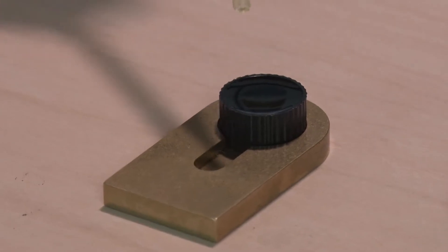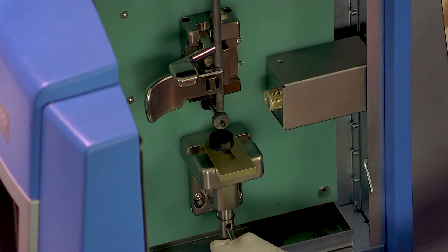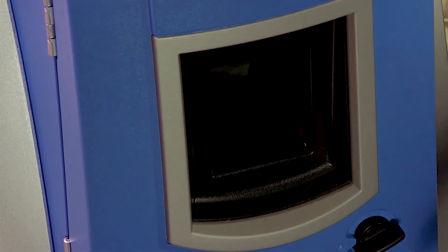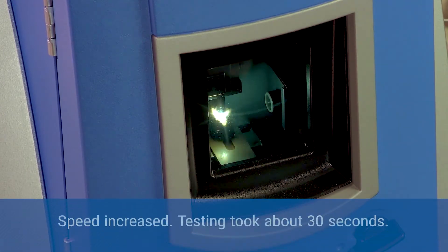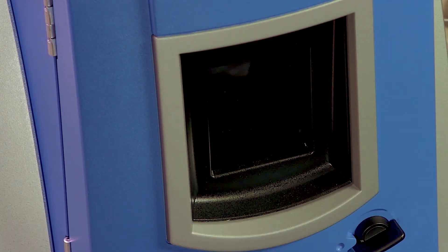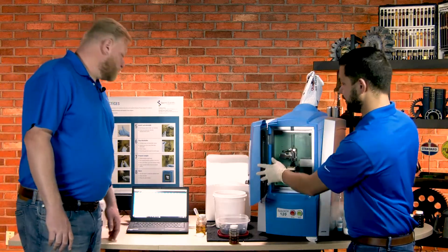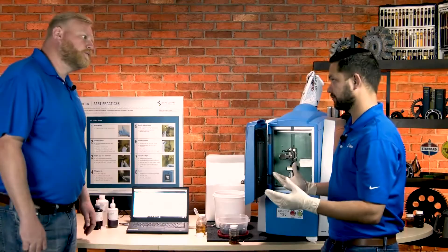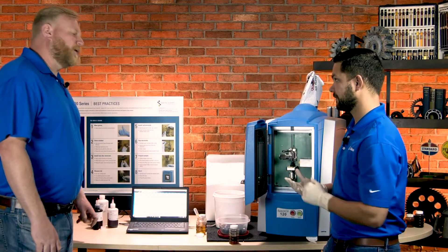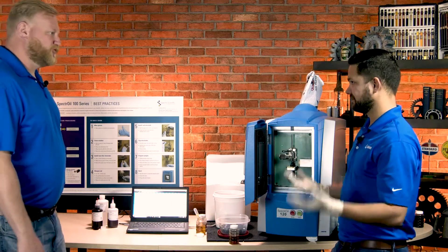Let's run a sample. I've got an oil sample already prepared in this tray. I place it in here, lift this up, close the door, and make sure it's locked. Once I hit start, the analysis runs. Once it's complete, everything gets sent automatically to the computer. You can see all the elemental data — all 24 elements — shown right there. This is what appears on oil analysis reports, everything in parts per million. They even have a poster to walk you through the steps, but once you do it a few times, you have it down.